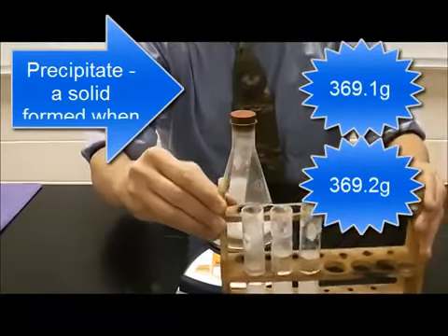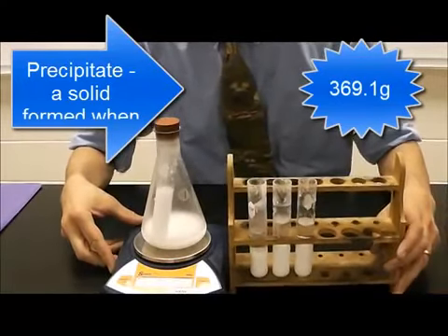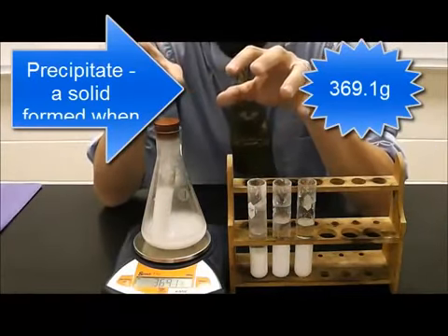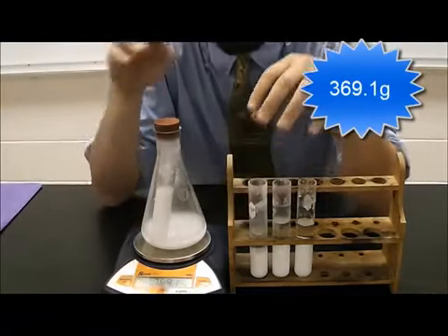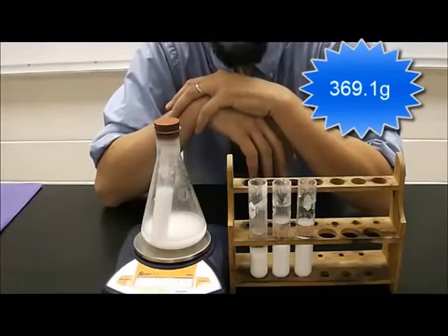If you want to see some that we've done before, they're right here. And this actually should give you a good idea of where the word precipitate comes from. We've got this white solid that's created in the middle of the solution, and what happens is it slowly precipitates down to the bottom. So it's kind of like precipitation that happens outside, except we call it a precipitate.